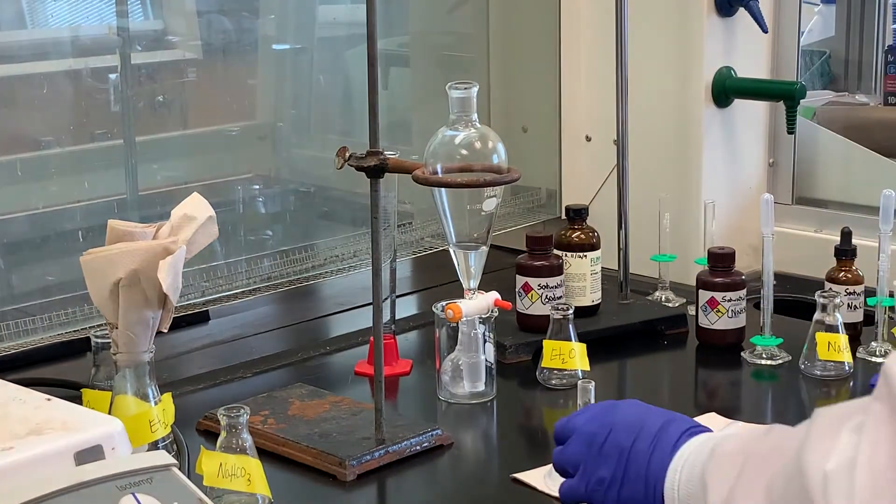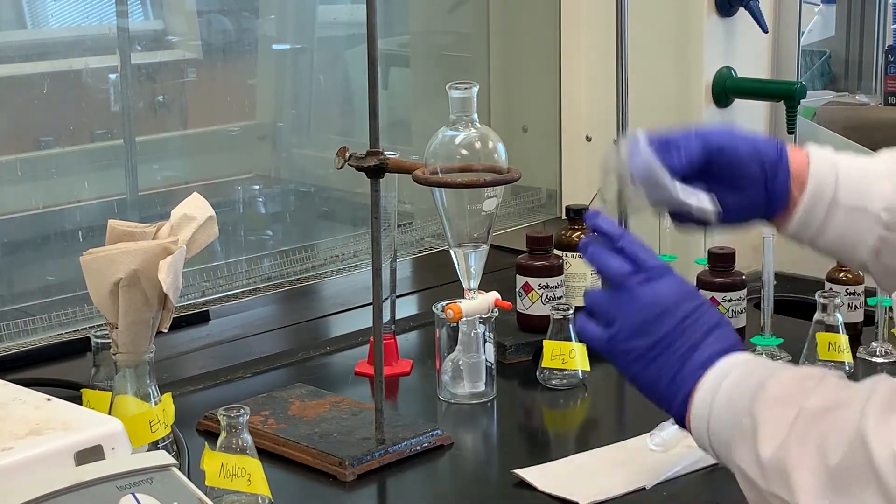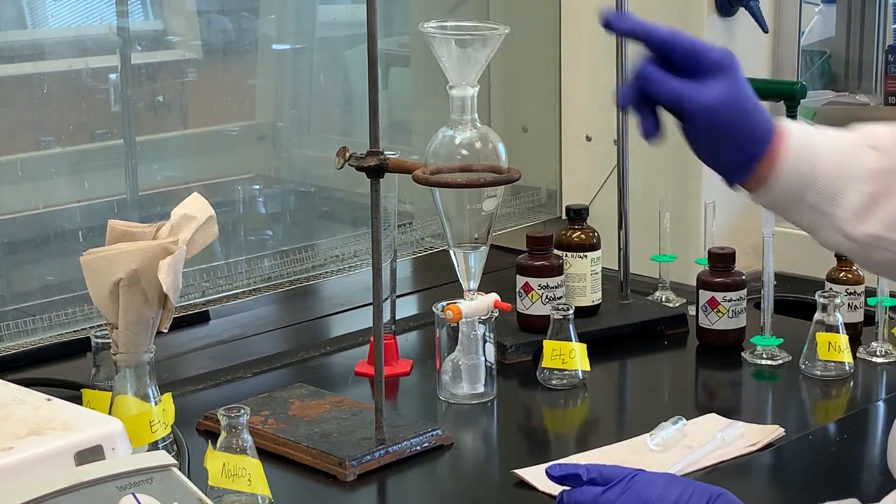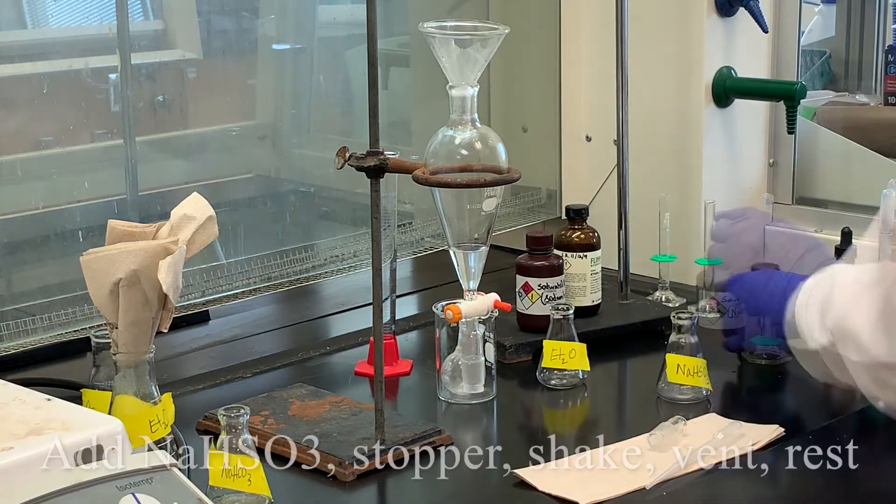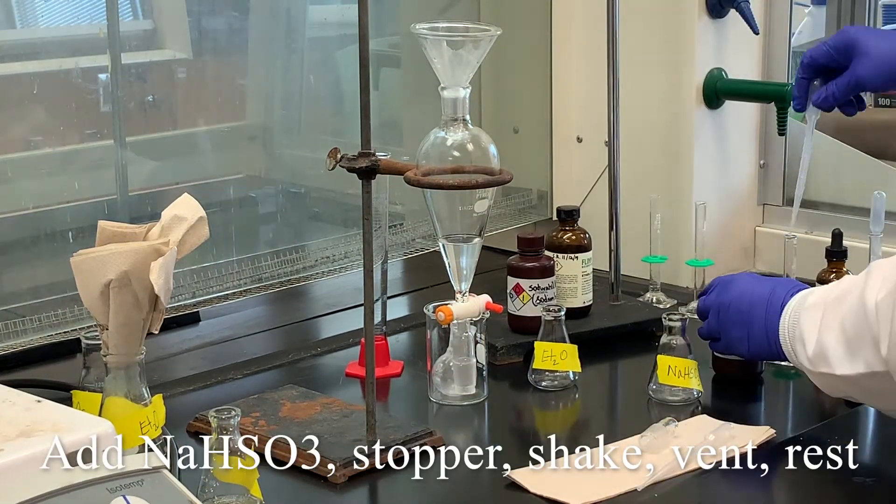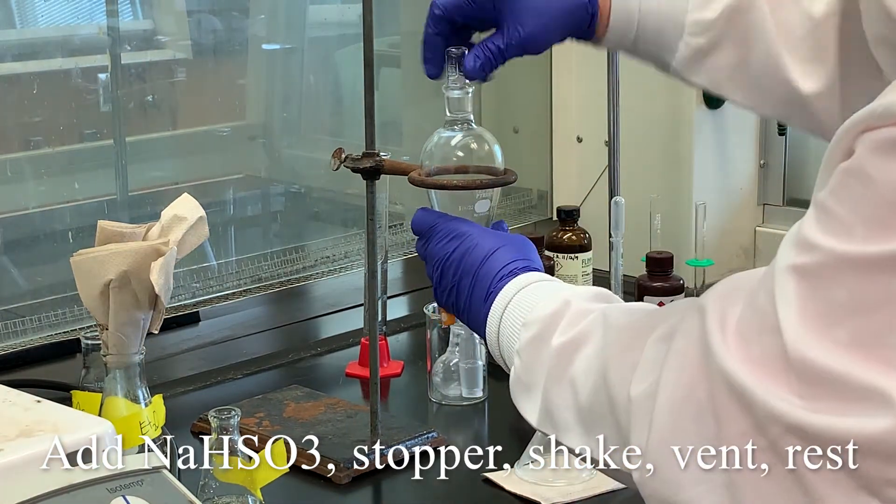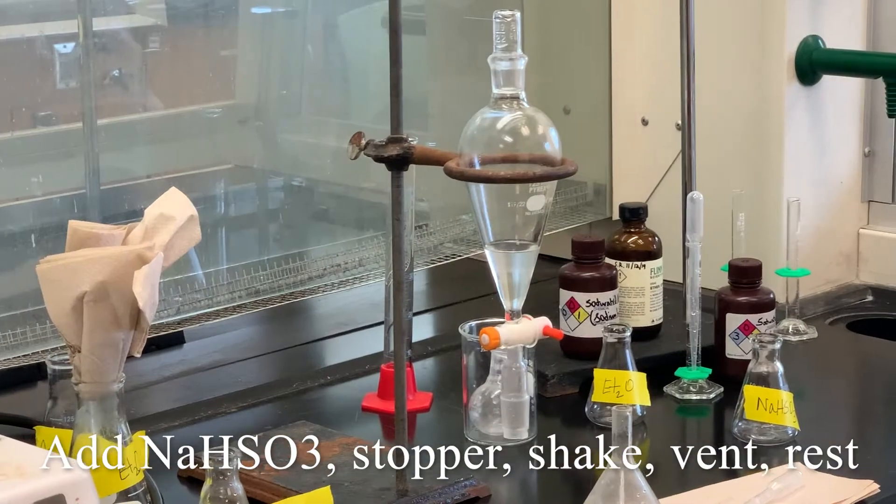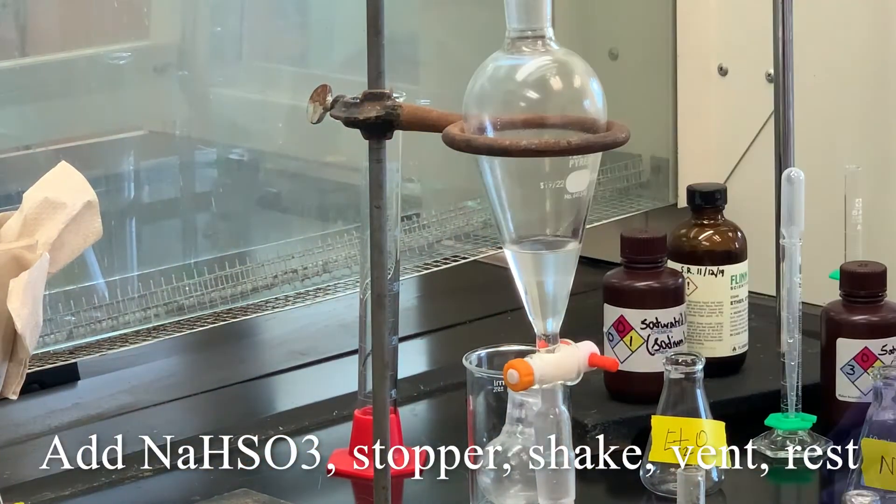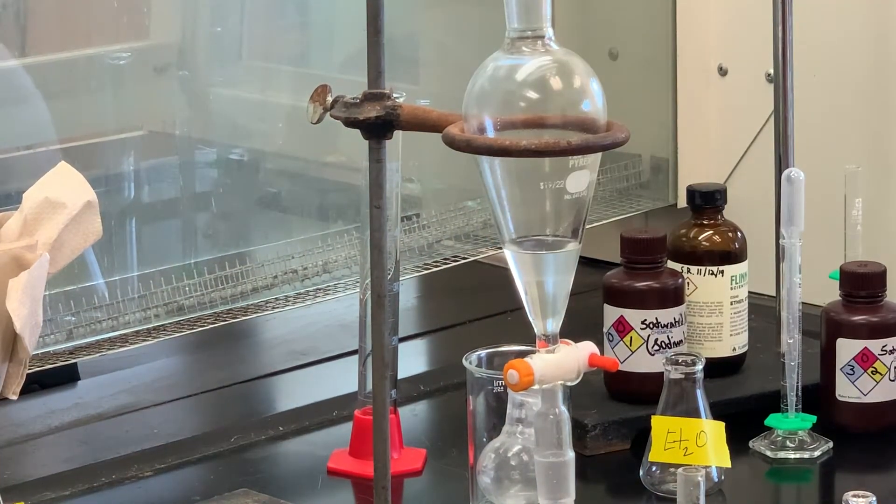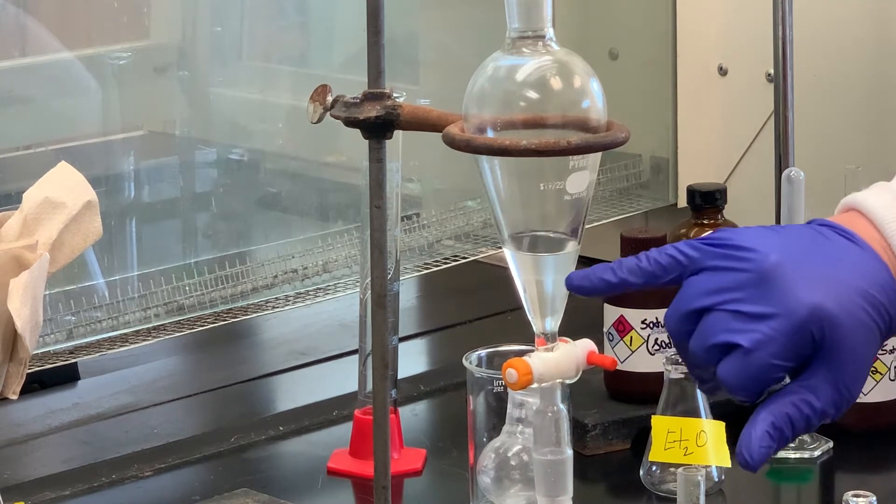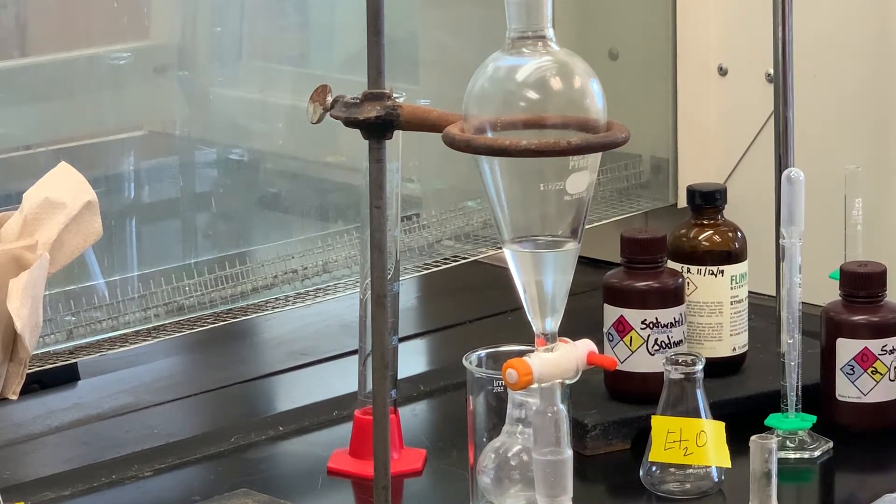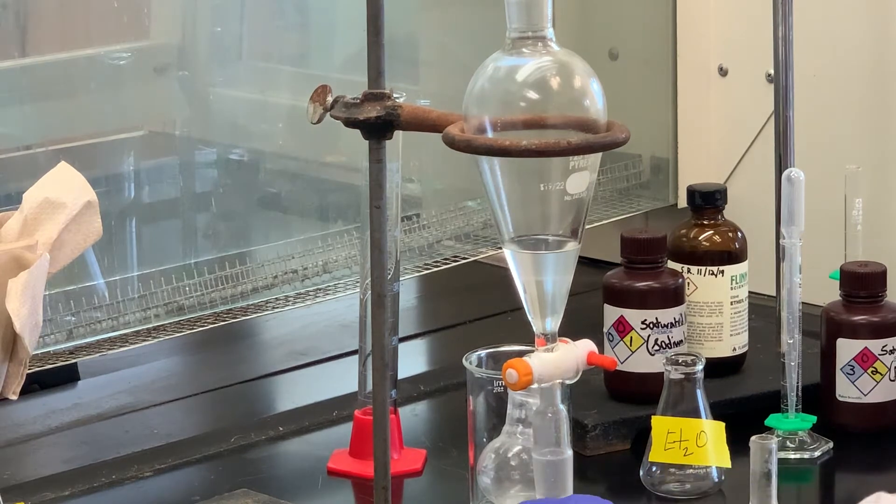Now I'm going to add to the ether layer five mils of sodium bisulfite. All right, we've got separation. You can see the line here. So we're going to drain off the aqueous sodium bisulfite washing.